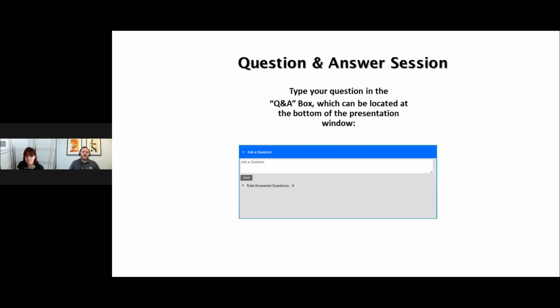Sure, great question. So in the sense of a negative effect, no, it does not. In fact, we can actually improve the sensitivity in some circumstances because we're able to separate out some of these peaks from a noisy background. We can improve sensitivity, not because of any sort of signal count, but because we're able to remove a lot of that noise. So in some situations, we actually get a benefit.